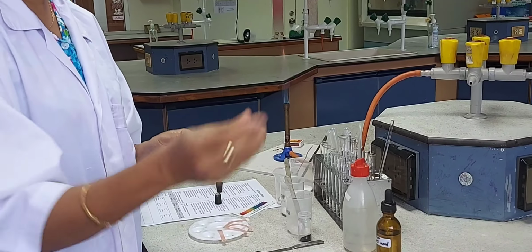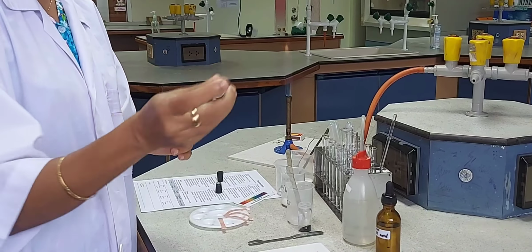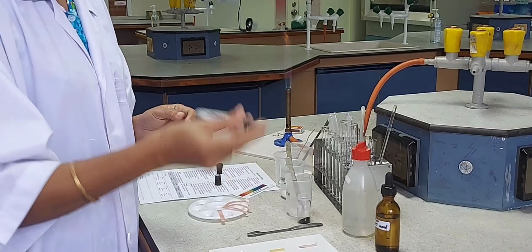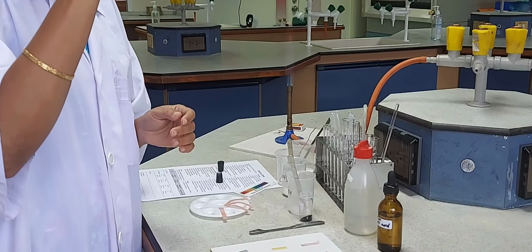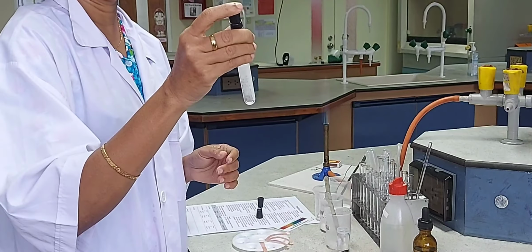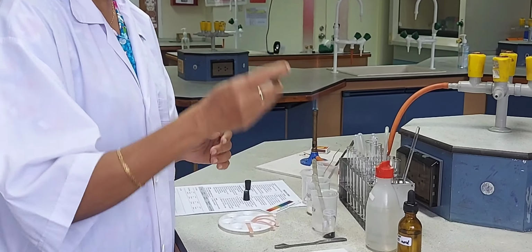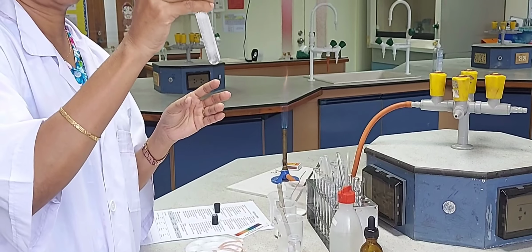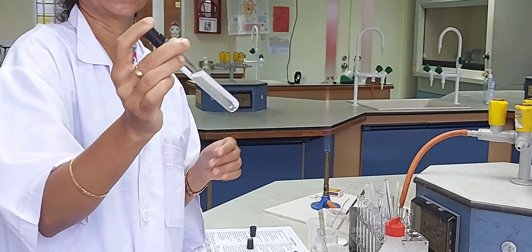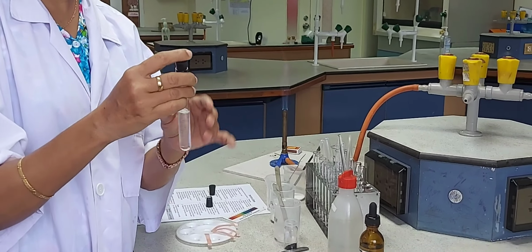The test tube is becoming warm as the sodium hydroxide is dissolving in the water. Okay, so you can see that the sodium hydroxide has completely dissolved and the solution formed is an alkali.